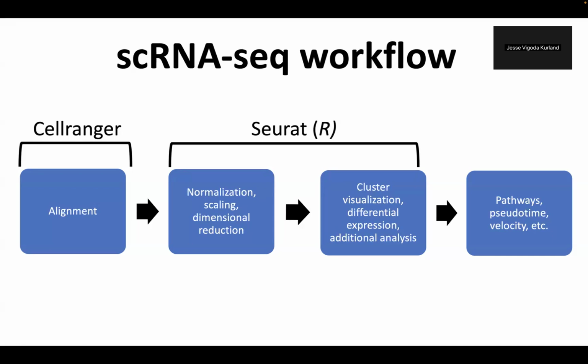Within Seurat, we can also do clustering. We're going to generate clusters, visualize these clusters, and use them to do differential gene expression analysis. Beyond Seurat, if we want to do more after that, we'll have to use other programs, which Hope and Georgia will talk about, and Mary will talk about after this.